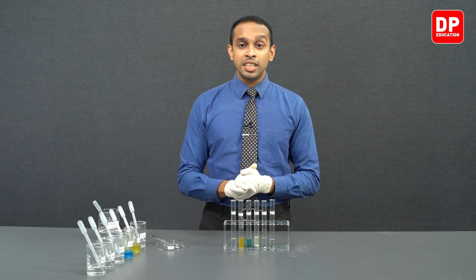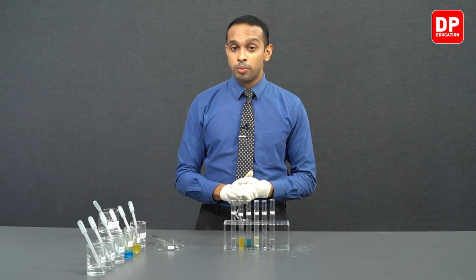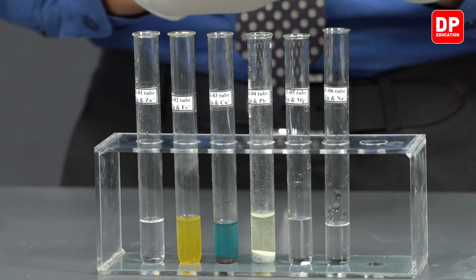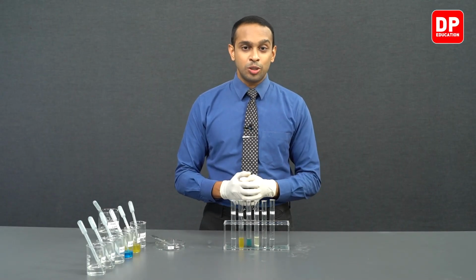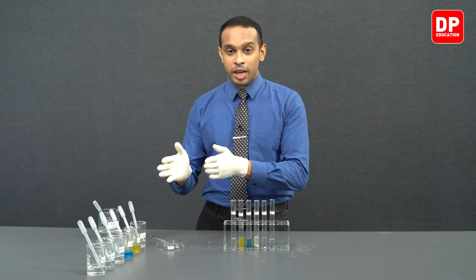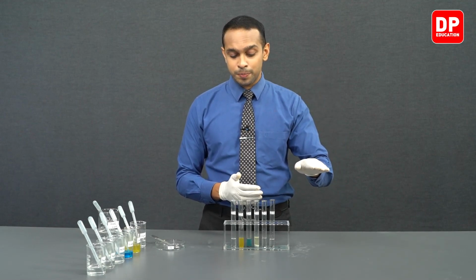So initially we took copper and added copper to each of these solutions. We observed copper did not displace any of the metal ions in these solutions. Copper is the least reactive out of all of the metals that are present over here today. So copper was assigned the least reactive state, so we could find copper in lower ends of the reactivity series.